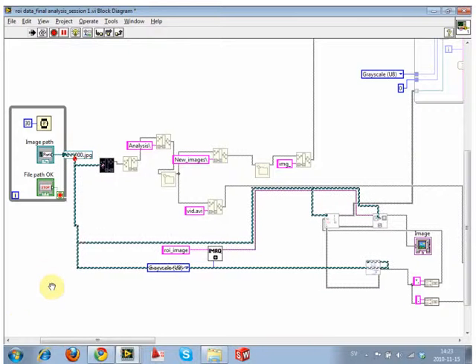So it's saying, look, stop on this wire. So this is where the current VI is if we stopped. So we can see what it's doing simultaneously. So it's simultaneously writing, stripping this path, reading these two paths, and reading this path. And all those things are what it should be doing. Now if we take the pause button off, it'll then keep going.